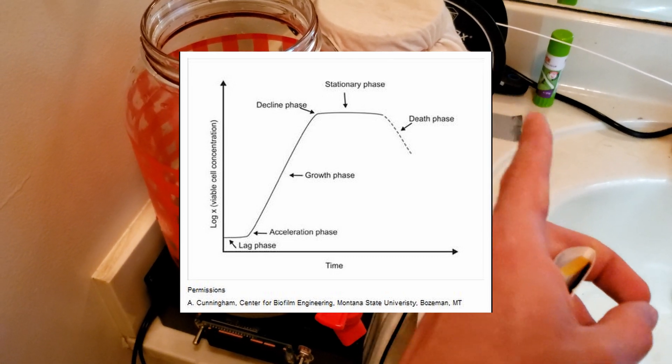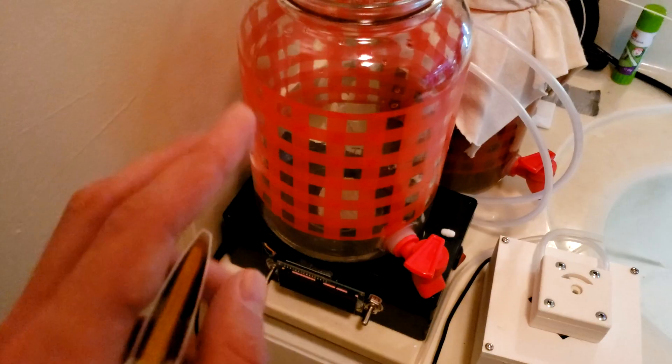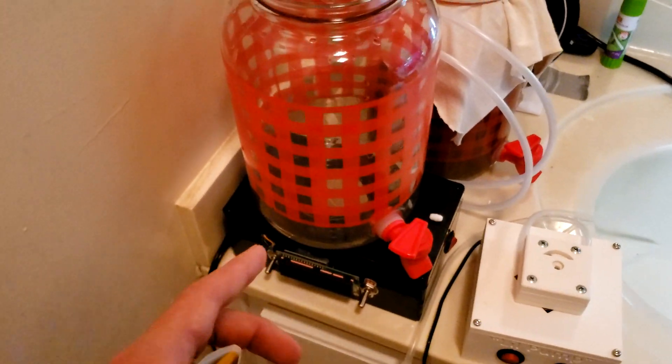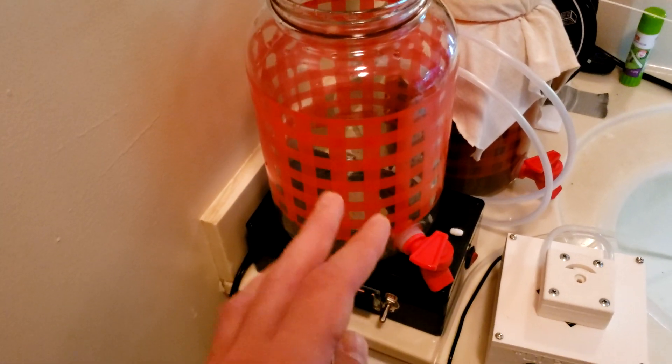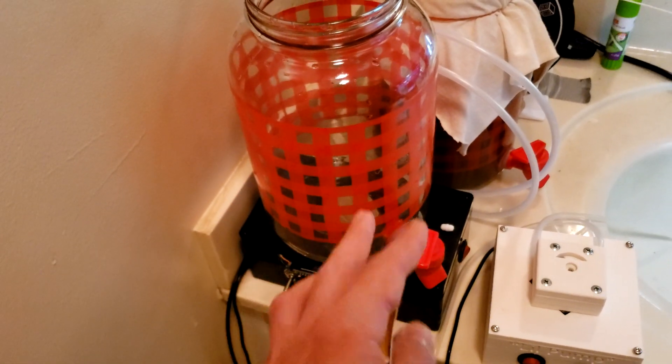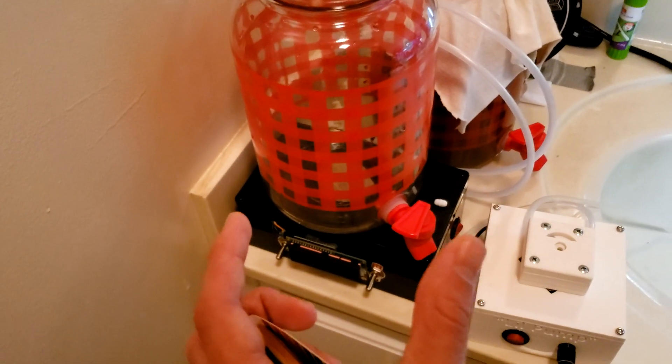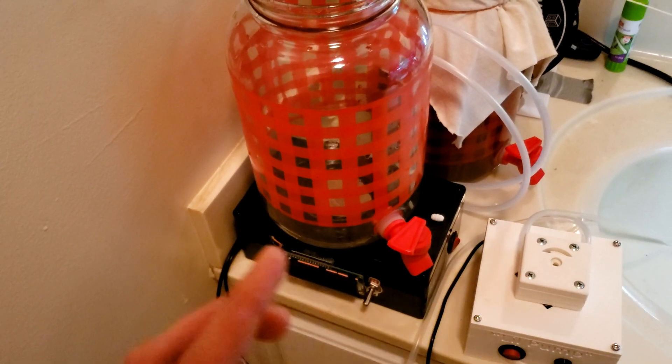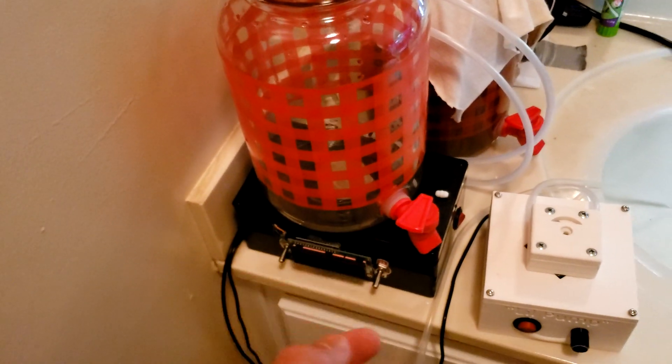And if you're lucky, it will just slow down. And if you're unlucky, you'll start a death phase where the cells actually start dying out because of low nutrients. So what a fed batch process can achieve is an extended duration of the exponential phase. So by controlling exactly how much fresh media is in the container, then you can keep it within that range of substrate concentration to maintain that exponential growth rate and hopefully grow the organism faster.